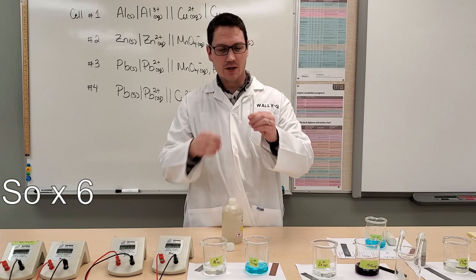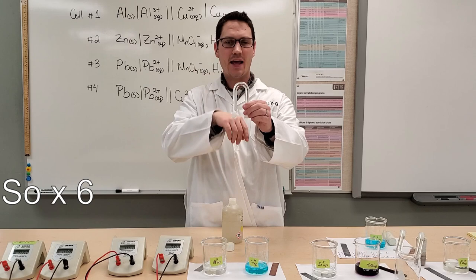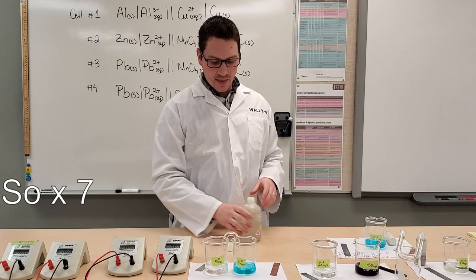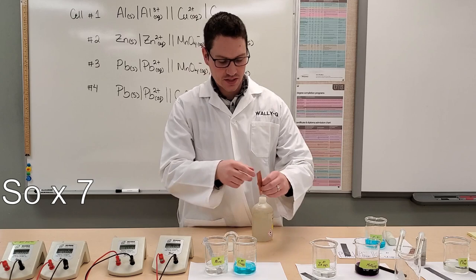So we need this salt bridge. There we go. We need this salt bridge to be able to allow the flow of cations and anions in whatever direction they're going to go. So we've got our salt bridge, and we connect our two half cells together.